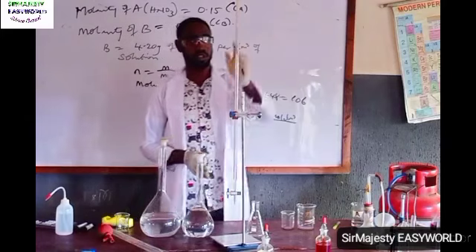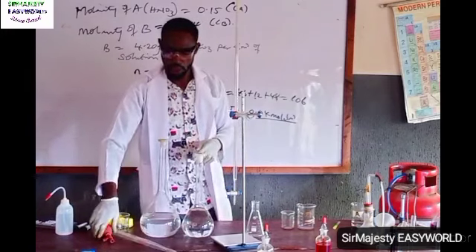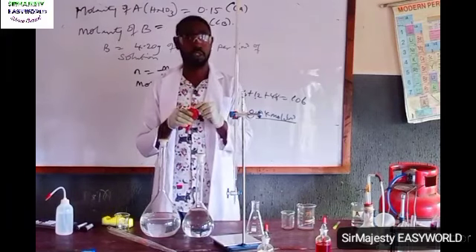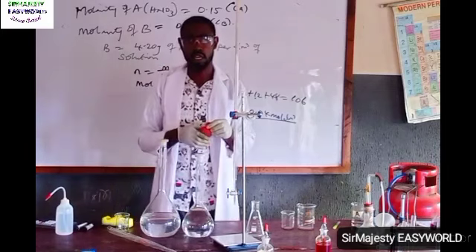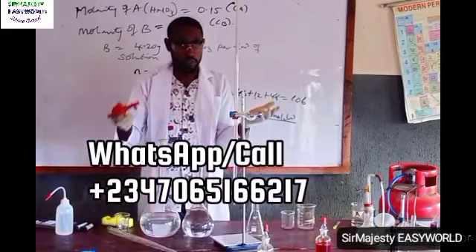So first, in titration, here is the buret, and here is my pipette. This is a 25 ml pipette. I also have my pipette ball or pipette filler. You can also place an order for your own, together with a pipette pump. I have all those things because sometimes the student might be in danger of swallowing the reagent if they use their mouth to suck. We are passing through the era of such chemistry and analysis, so upgrade to the use of such pipette fillers. They are cheap and affordable.